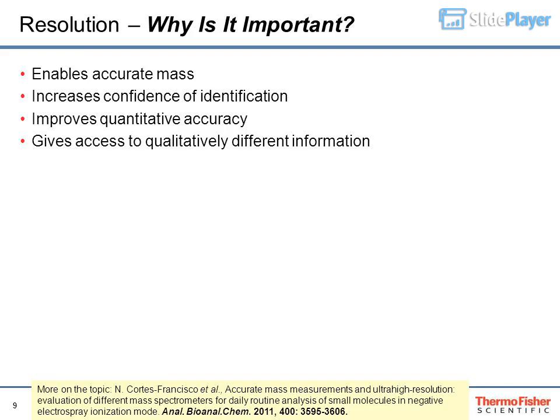It enables accurate mass. It increases confidence of identification. It improves quantitative accuracy. It gives access to qualitatively different information.